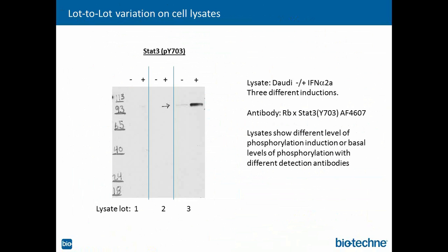And we did this on purpose. We used cells that had been cultured slightly different. We had cells that were cultured with more or fewer passage numbers, so you had a difference in age in the cell line. We also used different users. So we really tried to vary this as much as we can to see how robust the protocols are. And what came back is we essentially had only 1 lot that would, in this case, meet our QC criteria. So we actually have QC criteria on our lysates, and in this case, lots 1 and 2 failed.